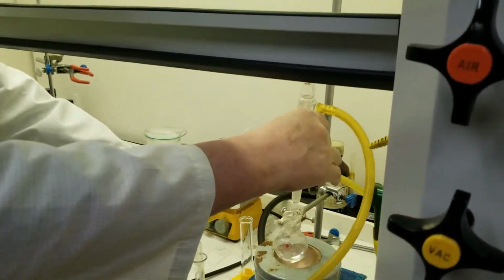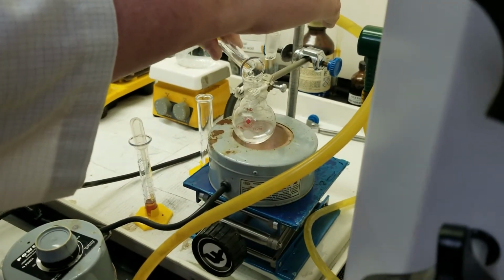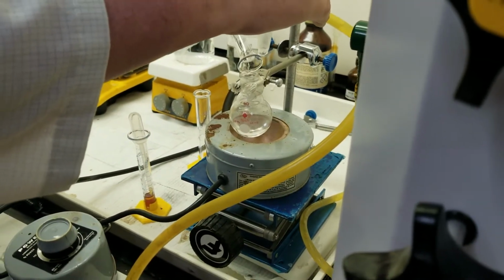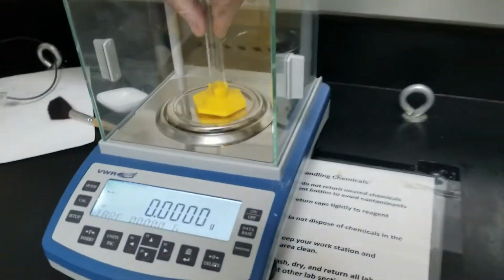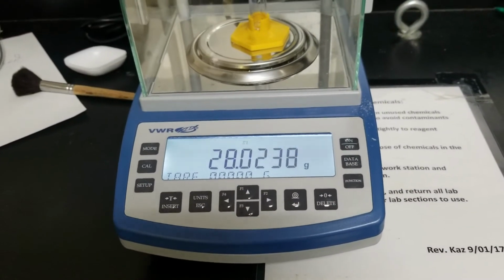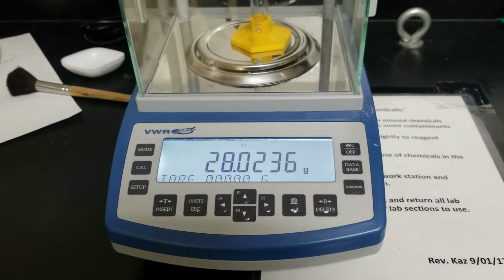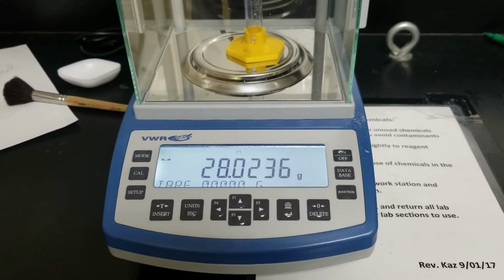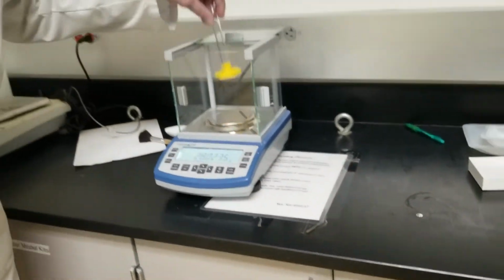We're going to pour the acetic anhydride into the glacial acetic acid. Even if it reacts with the glacial acetic acid, it will just remake acetic anhydride. Now we're going to weigh it again to know how much actually went in there. And we get the mass by difference. Mass by difference. This is for your stoichiometry calculation. Ooh, it smells wonderful. It smells like vinegar. Okay, right there. Okay.